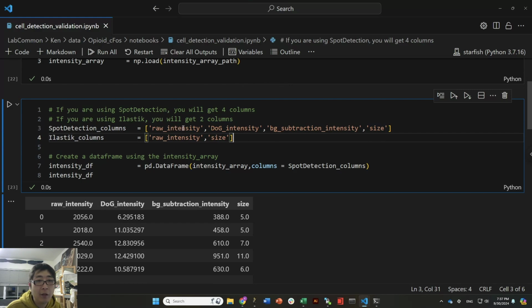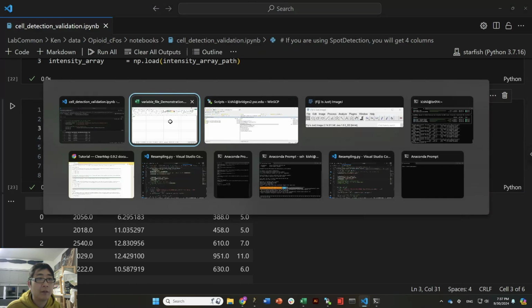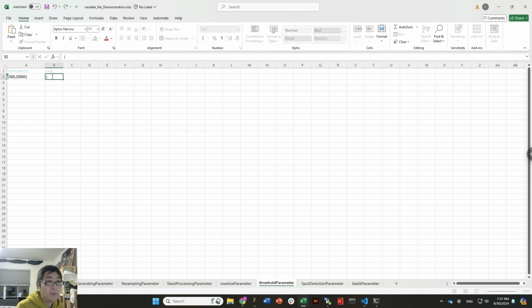So I would use row 0, 1, 2, 3. So I'll be using row 3. I will specify the row as 3, 3. This is the way it's coded, so just type in, if you want to use the first row, use 0, 0. If you want to use the second row, you use 1, 1. And then for the threshold, I will probably just set it as 100.